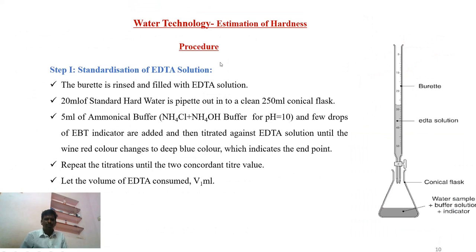So now we have to discuss the procedure, how to do this. The first one is standardization of the EDTA solution. That means we have to find out how many ml of EDTA is equal to how much calcium carbonate equivalent. That is very important. First we have to find out that.